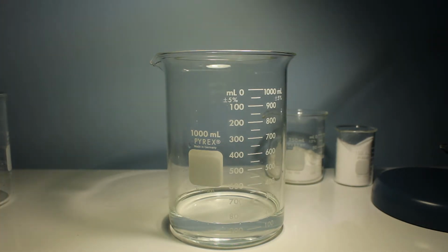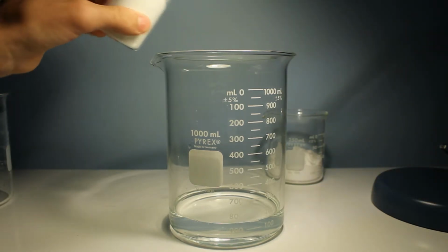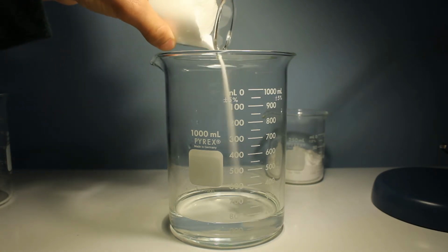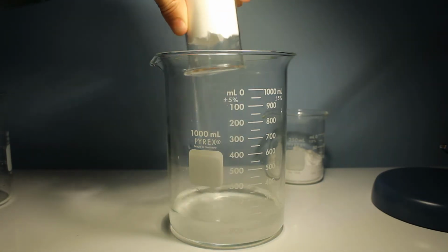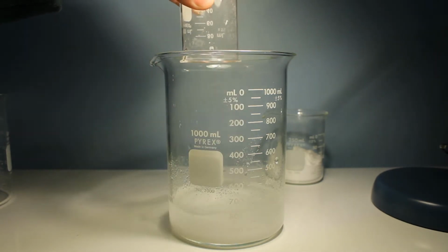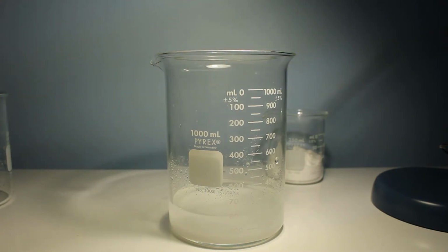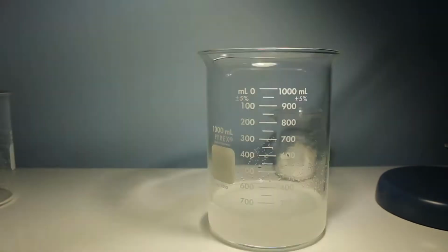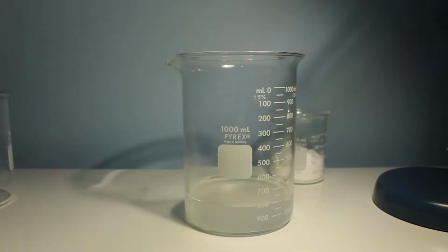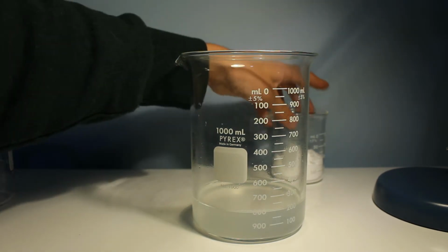Next, and remember, this is important, add the citric acid first. Final step, slowly add your sodium bicarbonate into the solution.